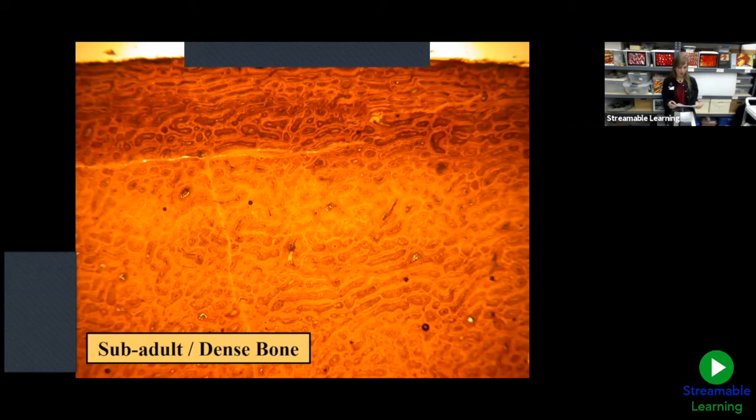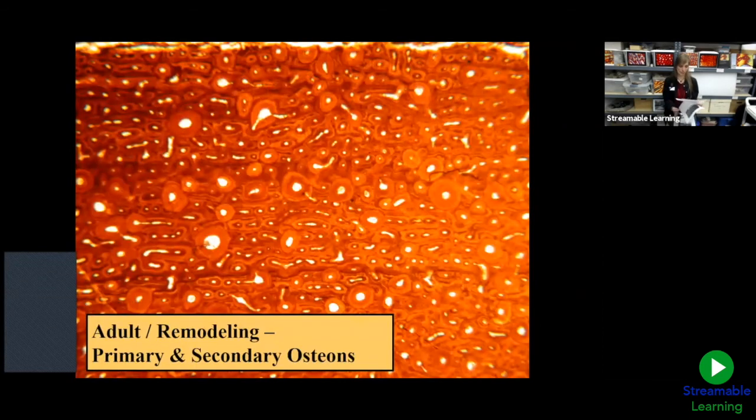In this subadult Maiasaura, the increasing density of bone tissue is very apparent. The vascular canals are still present, numerous, just not as open in this section. Here, osteons are developing as this bone begins to remodel, a process of erosion and deposition that goes on in the skeleton throughout a dinosaur's lifetime, and ours as well. Lags, or lines of arrested growth, are also evident in this image and can mark individual years in the life of the dinosaur.